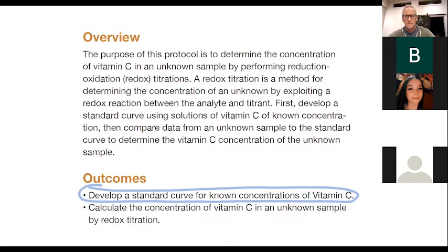Is that like a bell curve? Not quite. No, it is data on a curve, but it's not bell-shaped. It wouldn't be shaped like this. It actually would be shaped like this. Hopefully, because it's not really a curve. Hopefully, it's not a curve. It's a straight line. But when we make a standard curve, what is it we're trying to do?